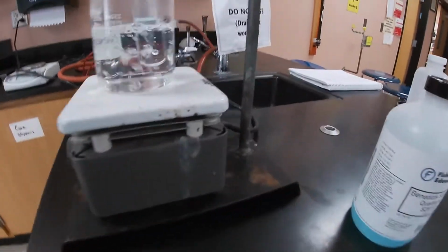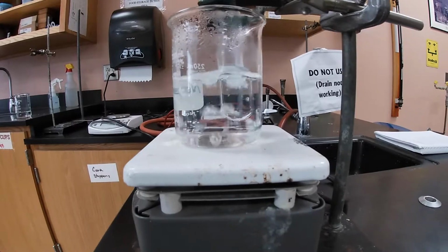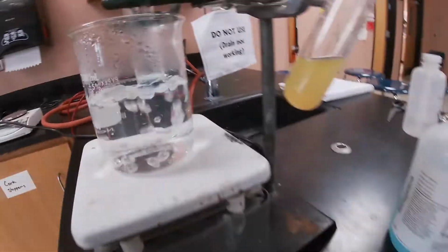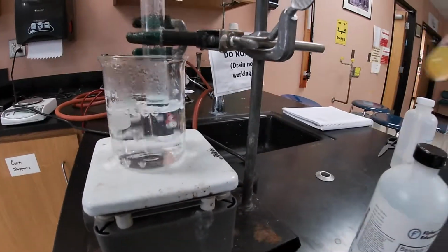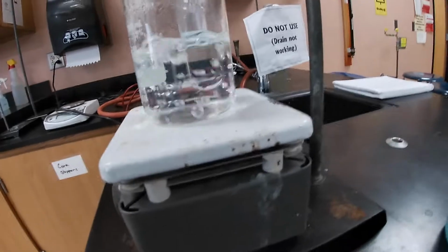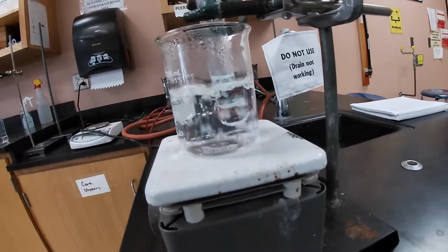So after 5 minutes, we noticed that after it being in the boiling water bath, it's still blue. It is not our standard that we are looking for, the yellowish. So if you compare it side to side, like I said, it's still blue. So that means there is no glucose present in the outside part of the dialysis container.